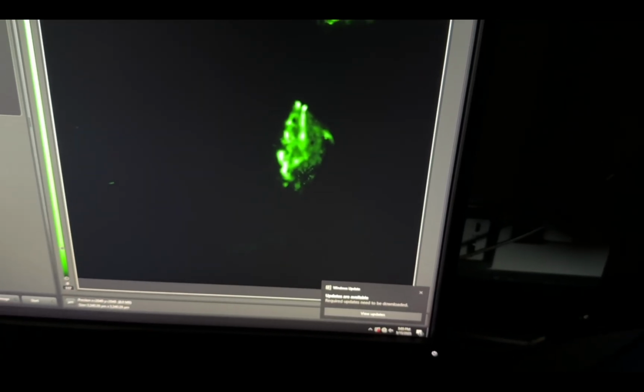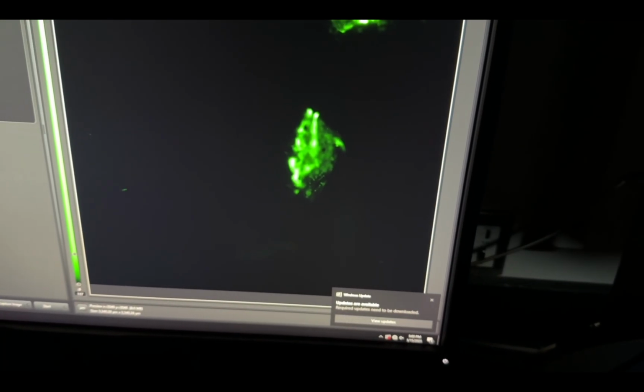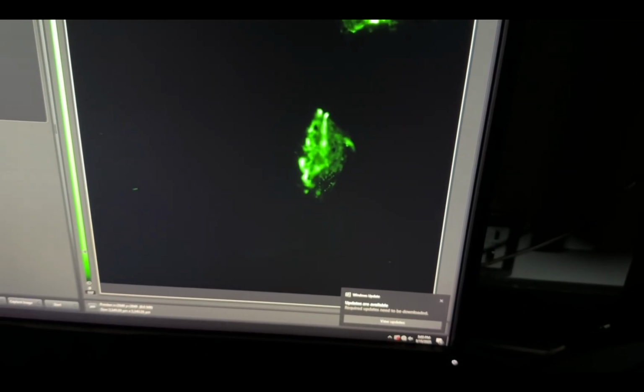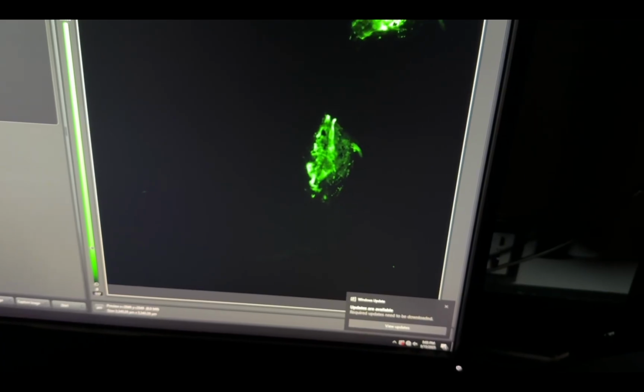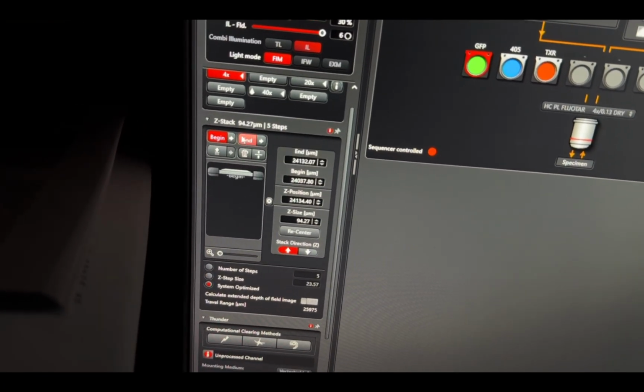So I'm just toggling between clockwise and counterclockwise until I get the other furthermost end in which I can still clearly discern anything. And I would say this is pretty good. So I'm going to go over here, I'm going to click end.